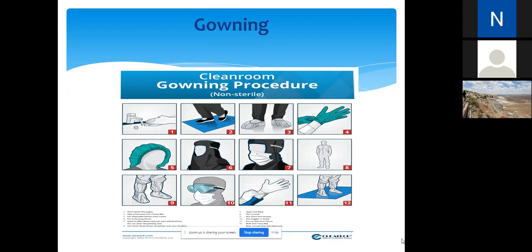And then the first thing, once you get in, is to do a few taps on the blue mat to get rid of some of the dust underneath your shoes. We have a rubberized motorized shoe cleaner. After you do that, you put your feet one at a time in the motorized shoe cleaner. After the motorized shoe cleaner, we also add another sticky mat, a white sticky mat that will lead you into the gowning area.